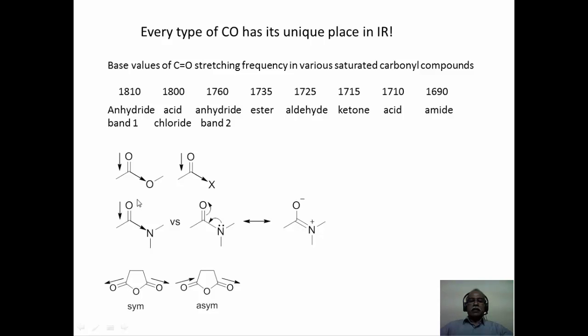Now in the case of oxygen, it is sufficiently electronegative to have this effect, thereby increasing the bond strength or the force constant of the carbonyl stretching frequency. So that comes around 1735.